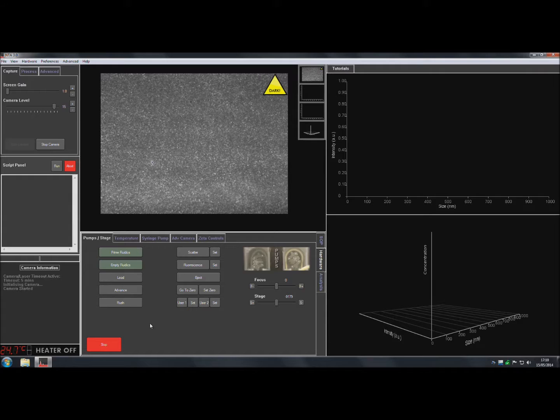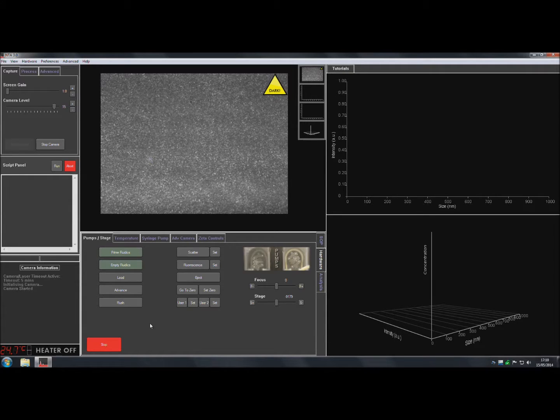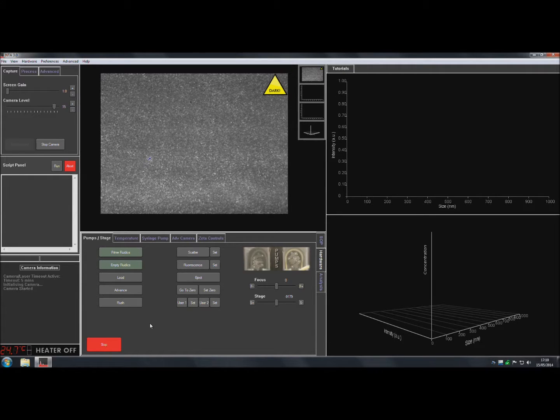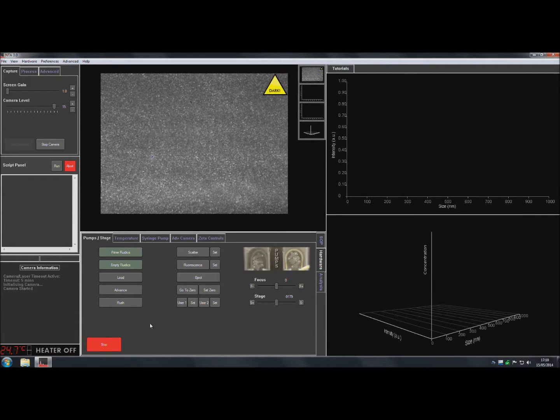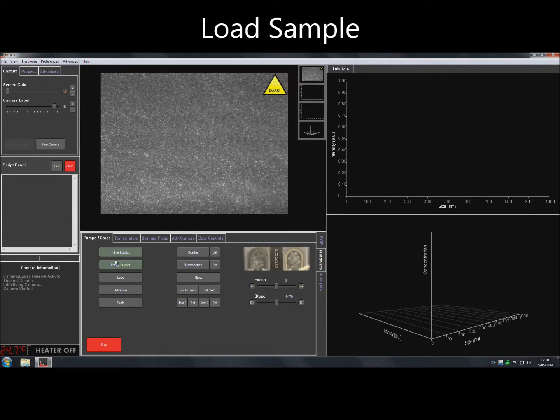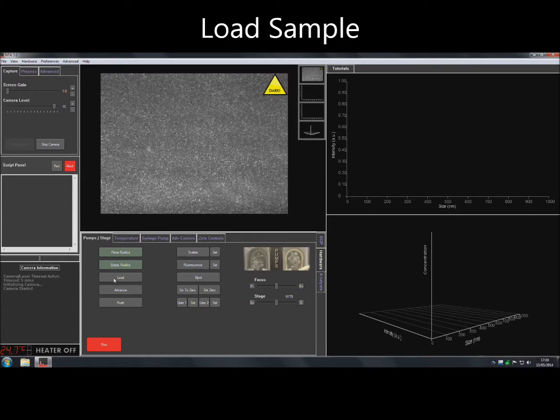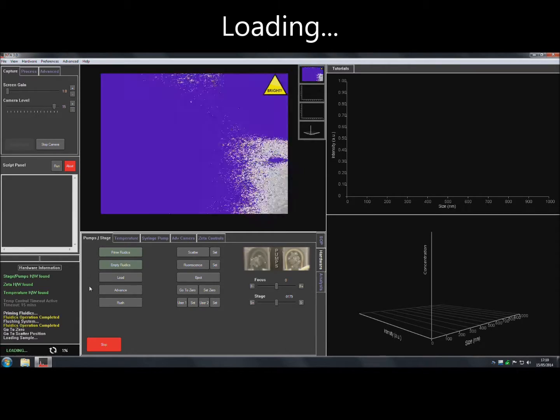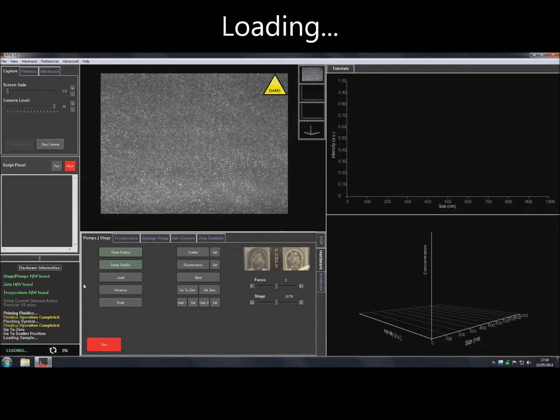Load the sample vial containing pre-diluted sample into the sample holder on the NS500. Then click on Load to load the sample into the sample chamber.